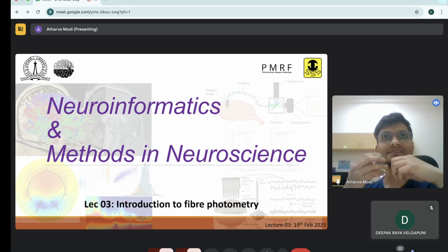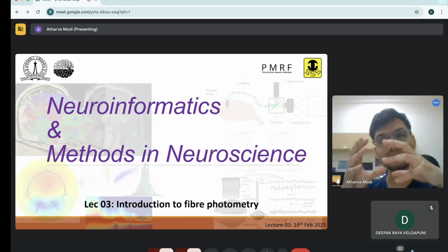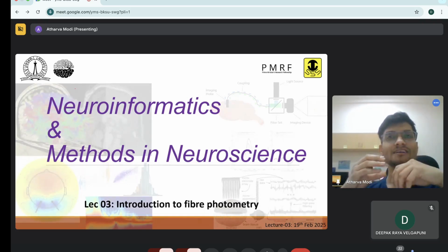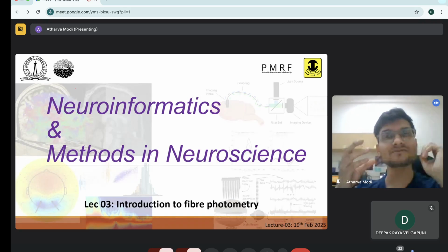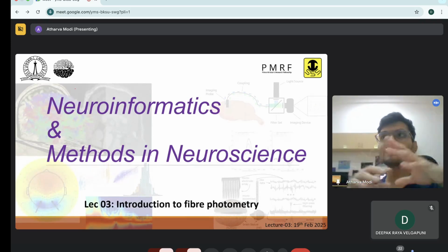So these are very recent developments in the field. This heat also results in vibrations inside the tissue, which ultimately results in ultrasound signals which we can capture from outside the brain. So these are all various different techniques.